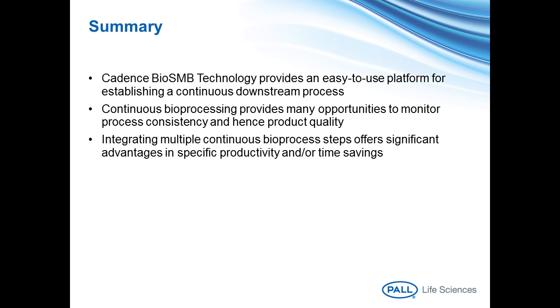And so we have two different approaches for viral inactivation depending on the scale we want to run on. So for the PD scale, the process development scale, we employ a really simple approach where we take advantage of the flexibility of the BioSMB valve block. So we have some extra valves that we can take advantage of. And we use those valves to do acid and base dosing in the VI step. And here we really are just doing dosing. We're not doing titration. But we have some data and a rather nice DOE to show that that dosing is pretty reliable. And we can always hit our pH set points for our low pH, for our hold, and then for raising the pH up to move on to the next step. So we have that solution on the PD scale.